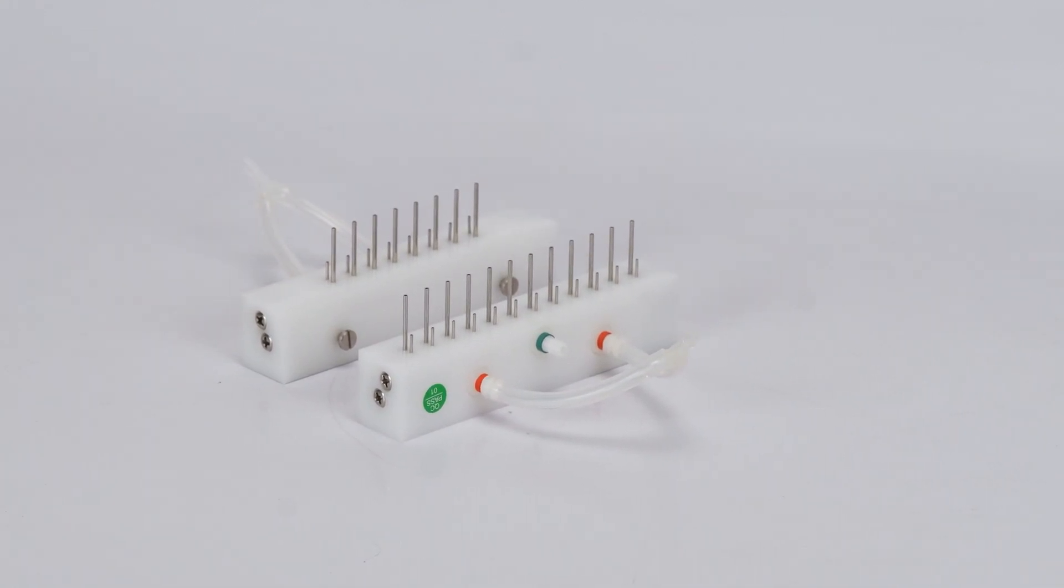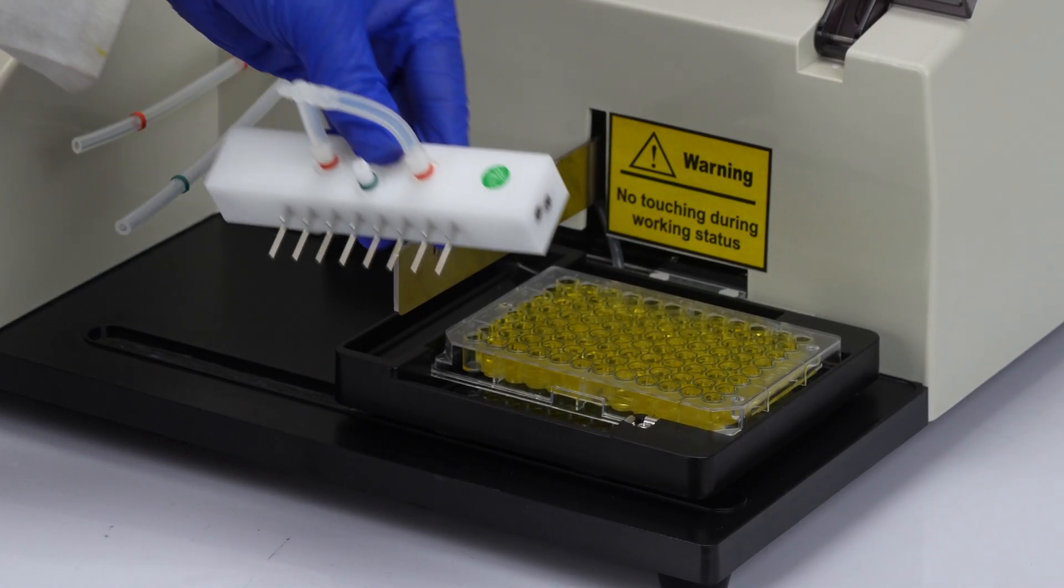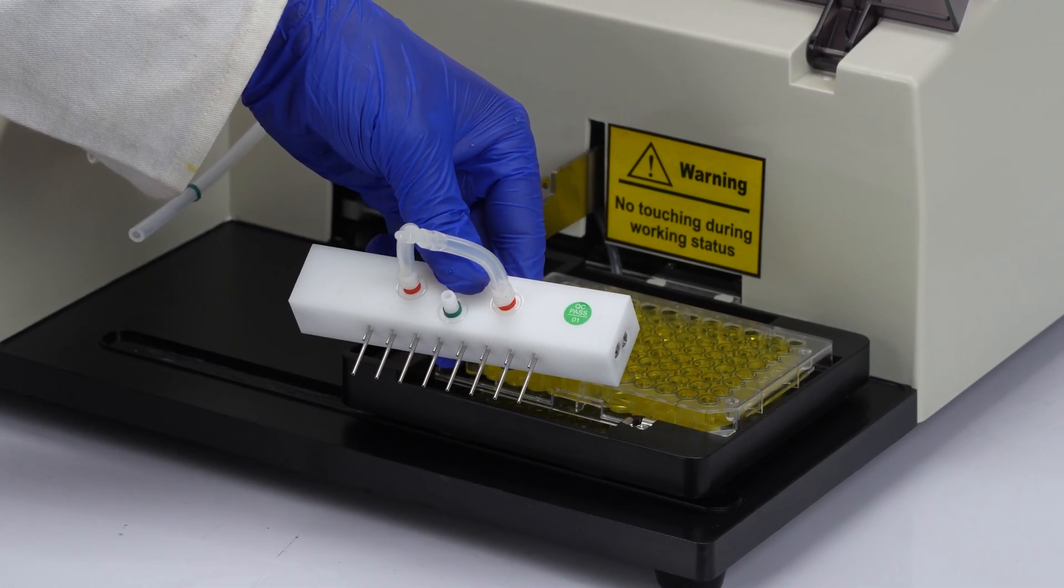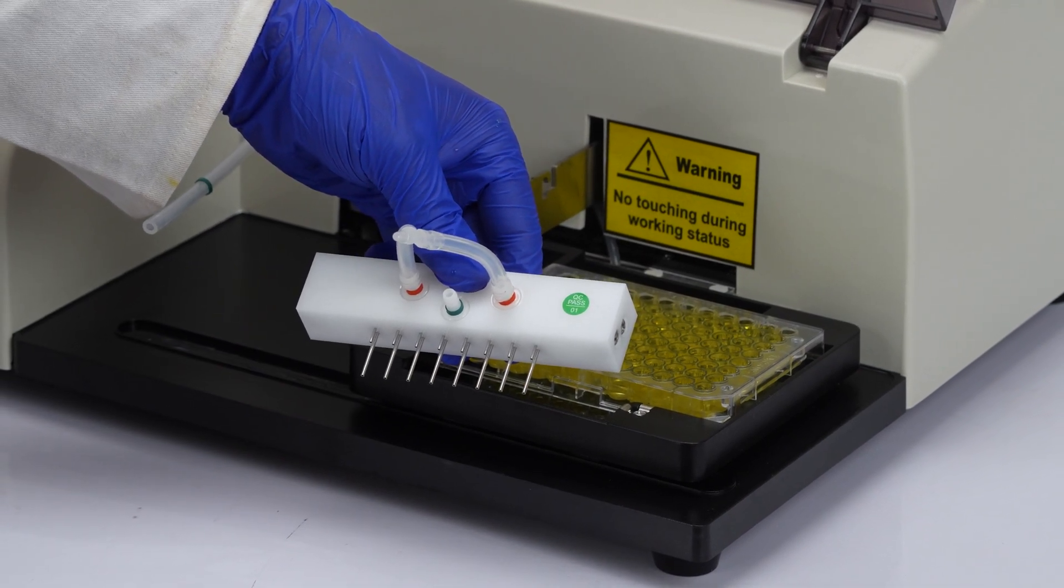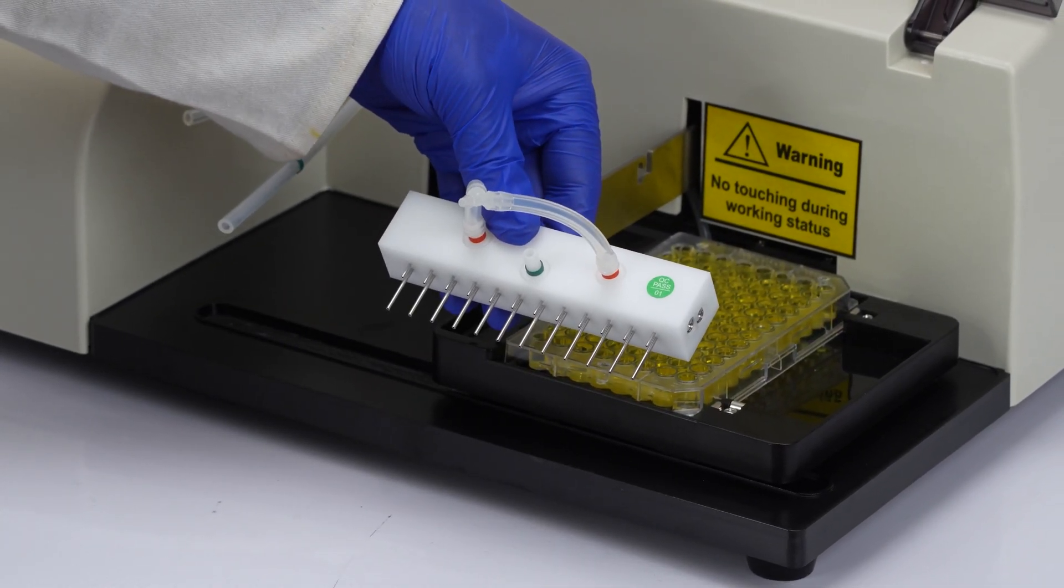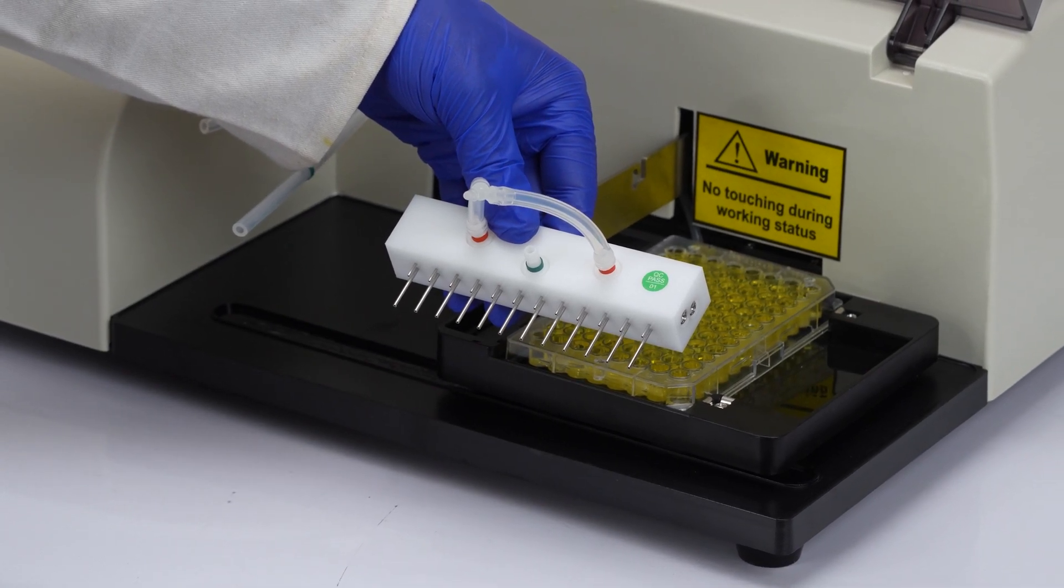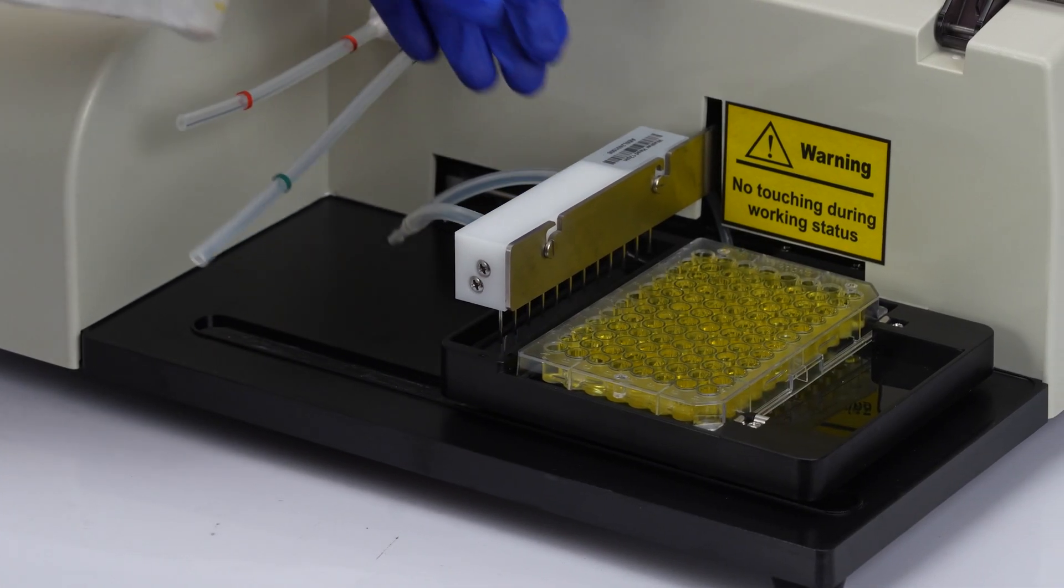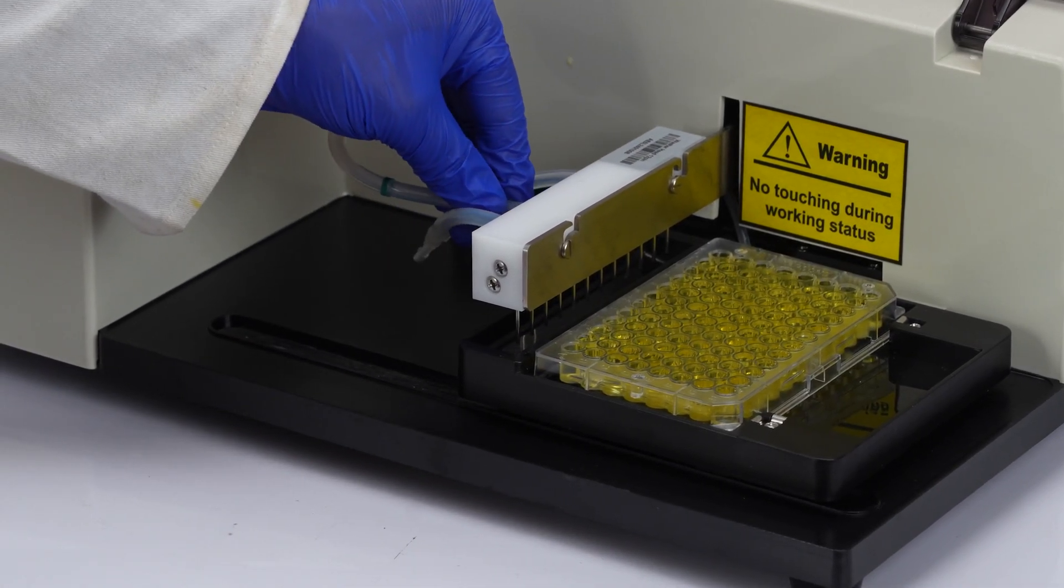Choose the 8 channel manifold if the ELISA plate is in a horizontal position or the 12 channel manifold if it's in a vertical position. Simply attach the manifold to the washer head and ensure it is firmly secured.